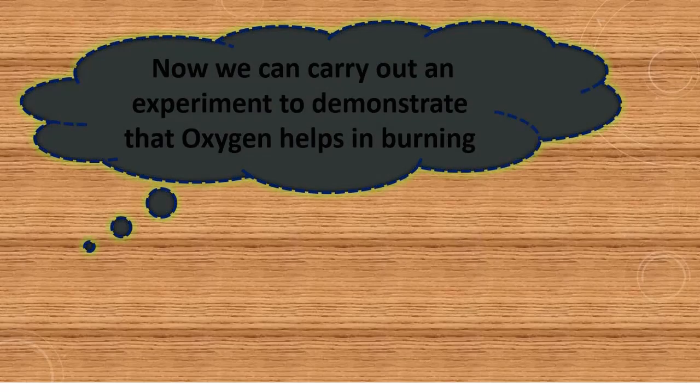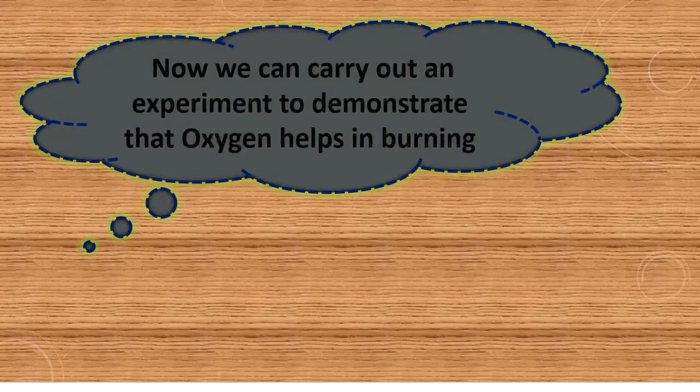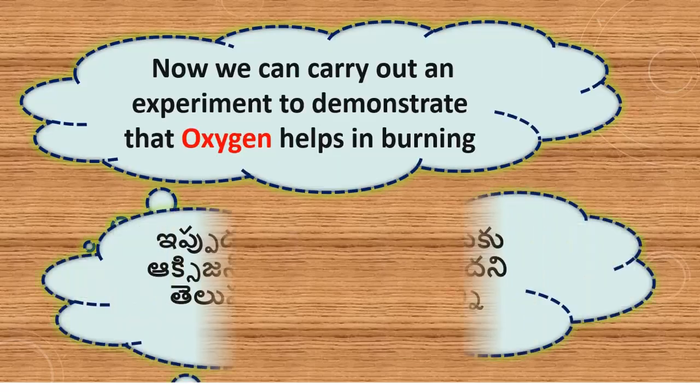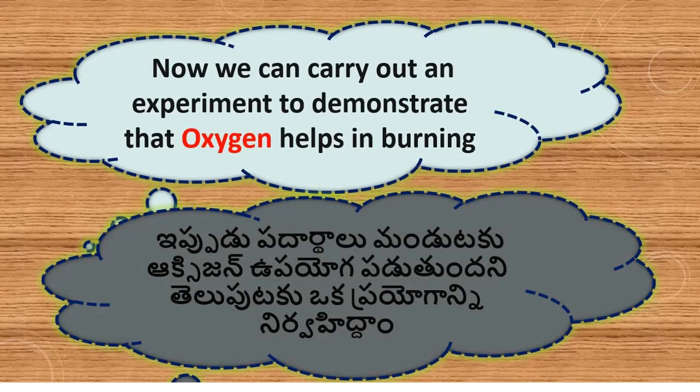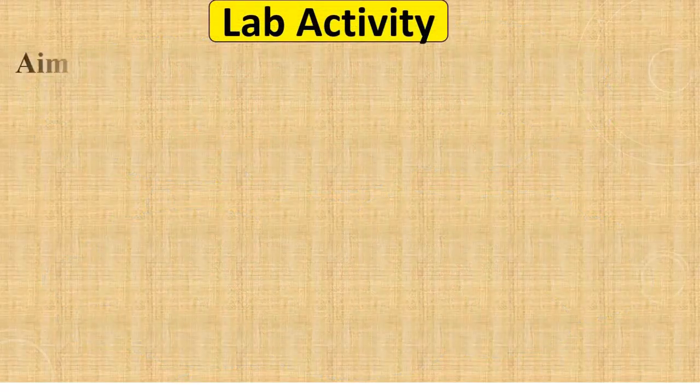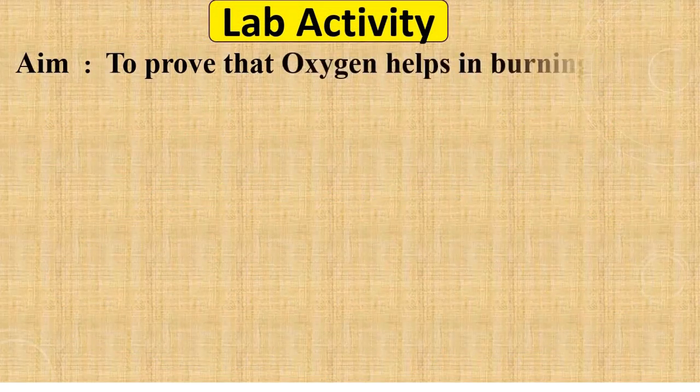So now we can carry out an experiment to demonstrate that oxygen helps in burning. The aim of this lab activity is to prove that oxygen helps in burning.